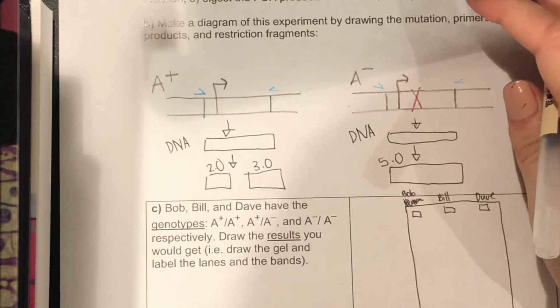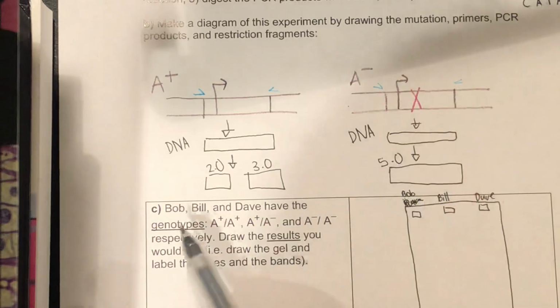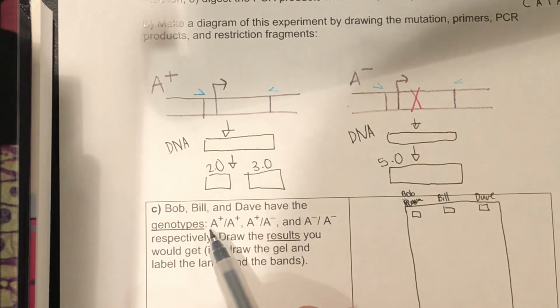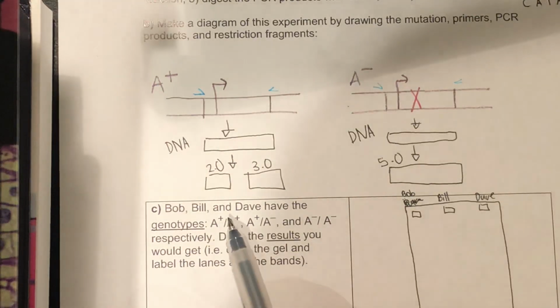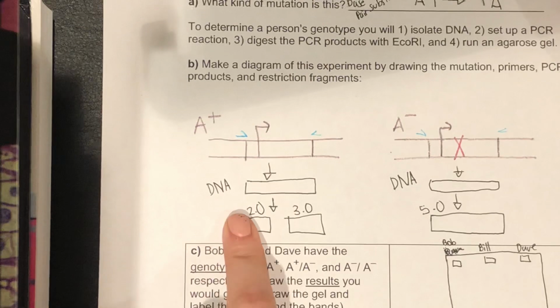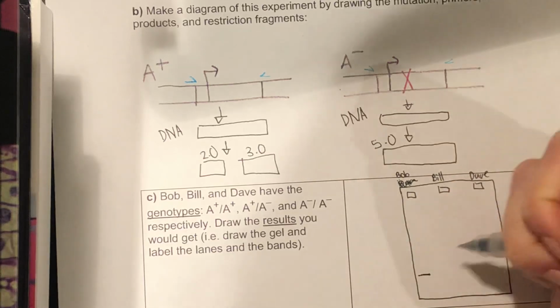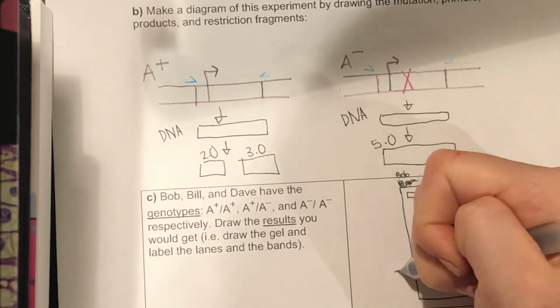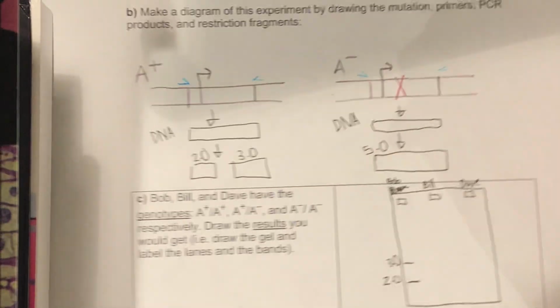And now looking at what we'd expect for Bob, for example, he has 2 functional alleles, the A+ and A+. So what we'd expect is bands of the size of 2 and 3, right? So here, you can just draw it arbitrarily. That would be 2 and that would be 3. And because they don't have any mutant alleles, we wouldn't get 5.